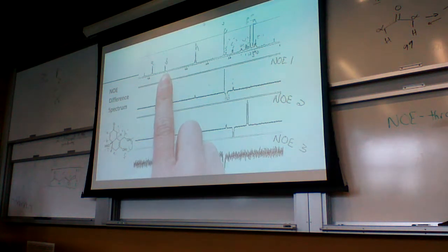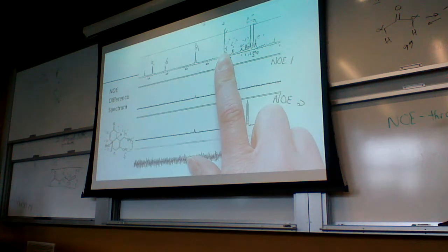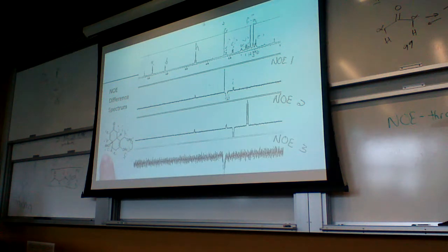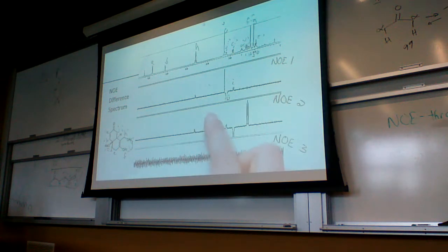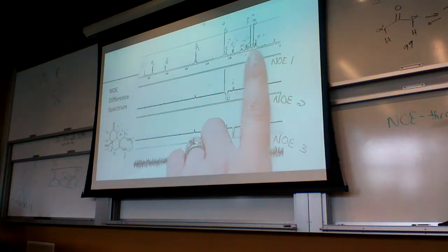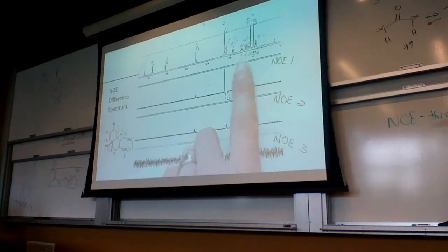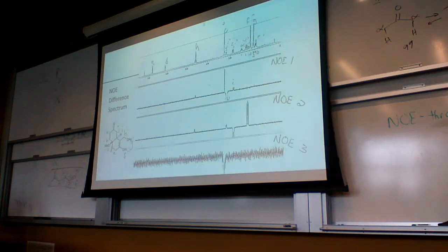A and B are the alkenes there. H is going to be the CH2 group that's right next to the oxygen. And then the C is the big methoxy group. There's two methyl groups, one's F and G. I'm not sure which one's which at the moment. And then we have J, I, and then another J over here, because those are diastereotopic, and D and E around there.